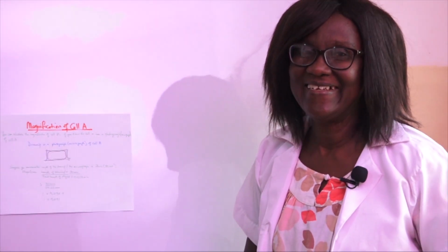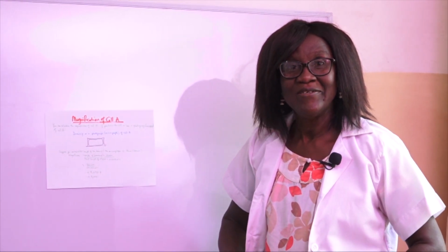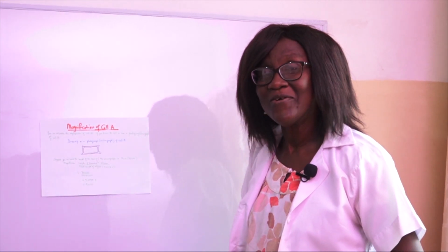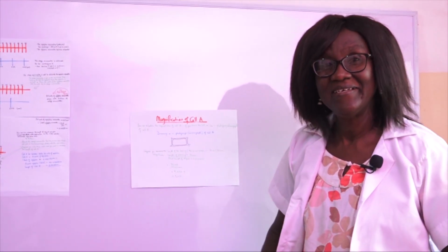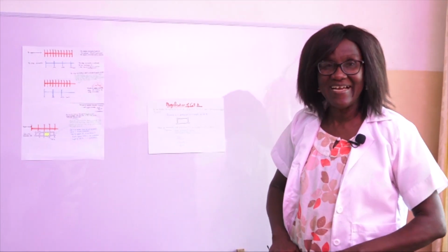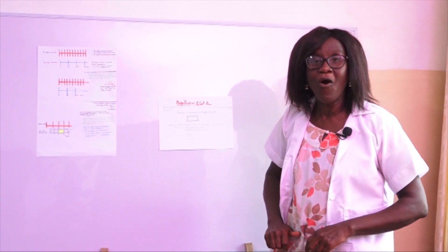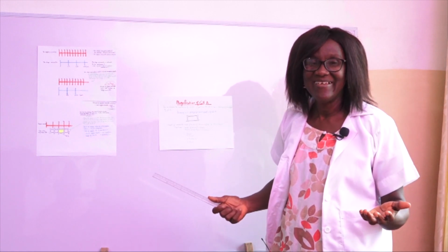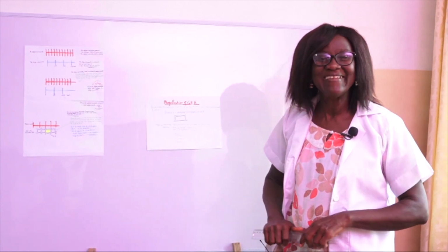We have to end here. For your homework, practice measuring the length of objects or structures with microscopes. You have to learn how to calibrate your eyepiece and use it to measure the length of structures on prepared slides of your own, or permanent slides that you have. Well done for being along with me.